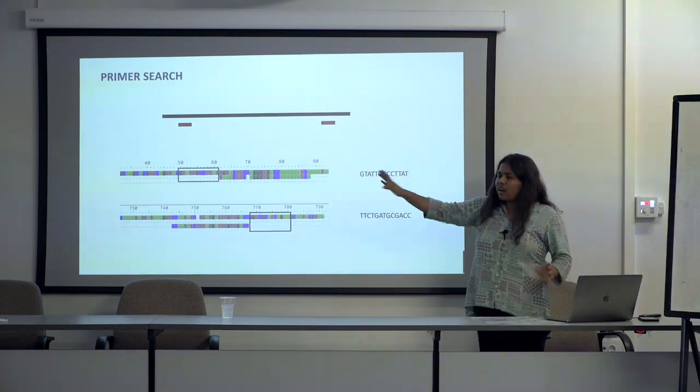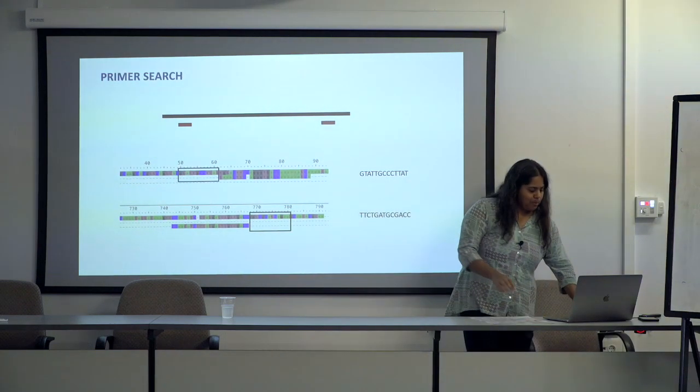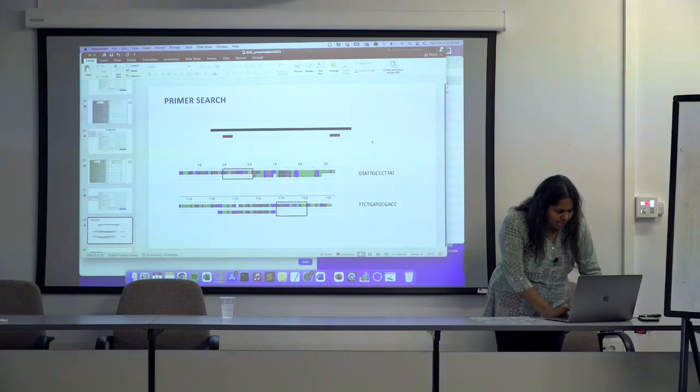So if you have started the run, hopefully this would have gone through the demultiplexing by now. I'm not sure, but is it running still?